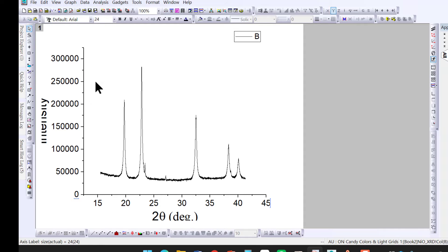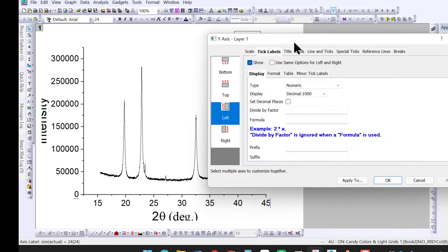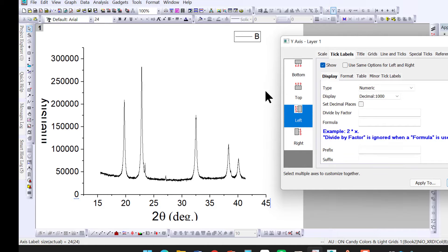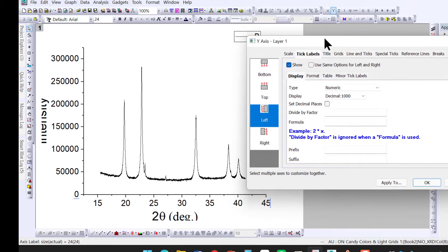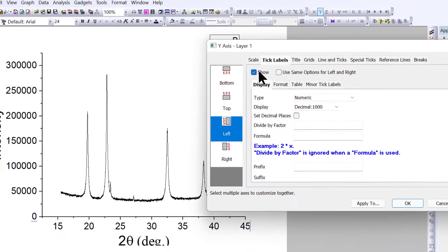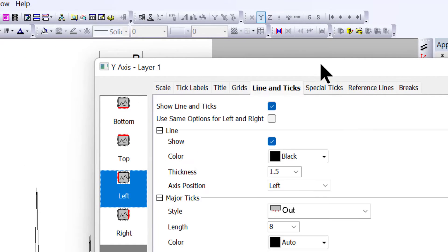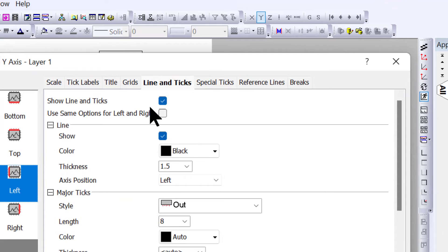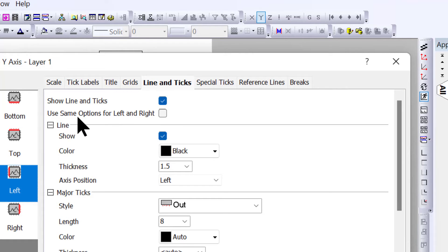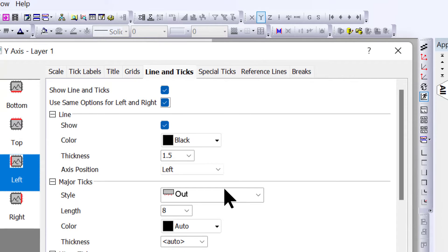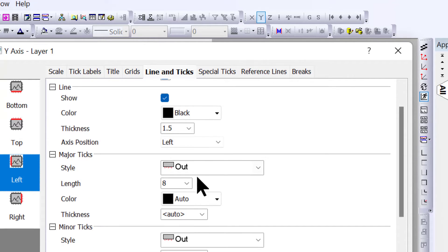If you want to create borders, you can see lines along the x and y axes, but there's no top or right edge. Click on the left edge, then click on Line and Ticks. Show line and ticks, and use the same option for left and right.